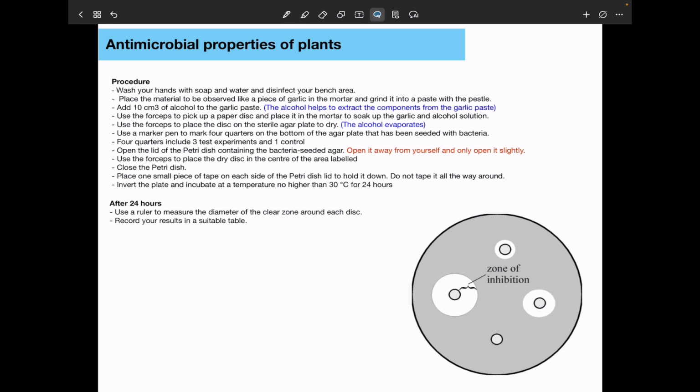You also have to make sure we culture at temperatures that are below the body temperature, again to prevent the culture of pathogenic microorganisms. During the culture, we have to decide, are we going to carry out a liquid culture or a solid culture? And then we have to choose the optimum conditions, like temperature and pH.